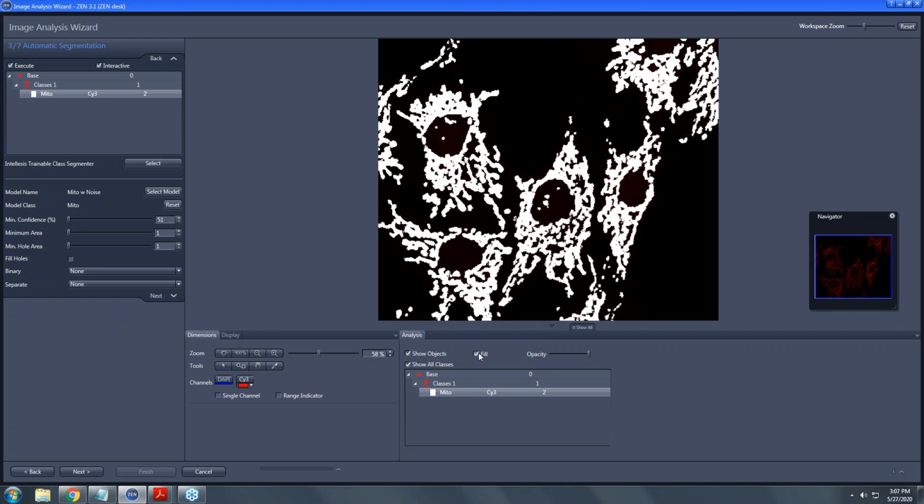You're fine. So what we're building to here is, what is the power of this machine learning? Besides maybe being relatively easy to operate, why is it that we would want to use the machine learning over the classic? If we do this analysis with an image that is very poor signal to noise, and that's what Nicole's going to do at the end here, and we compare the results between the two, I think it's going to answer itself as to why you might have some power.